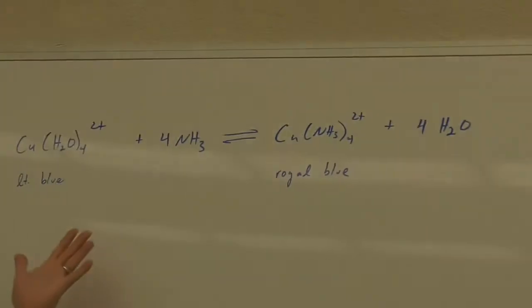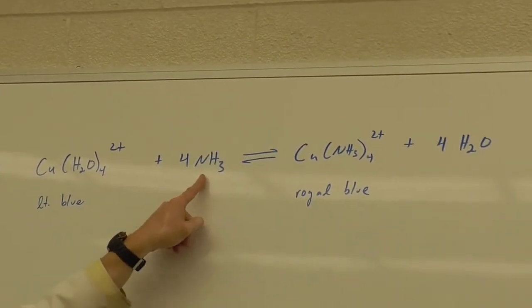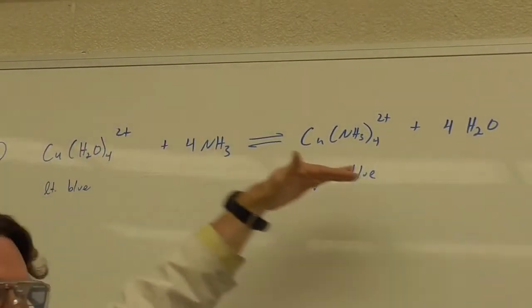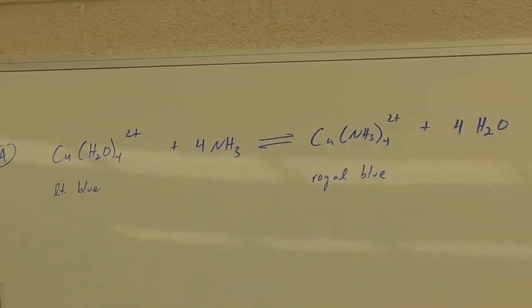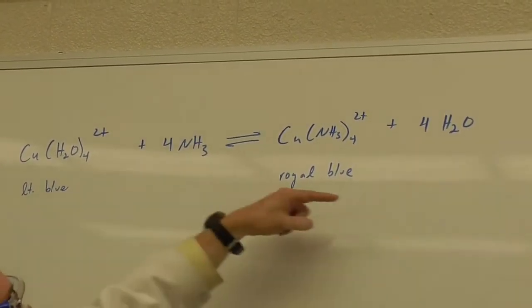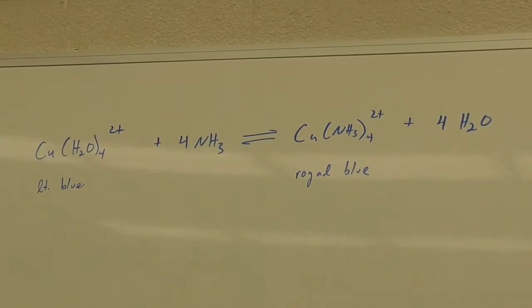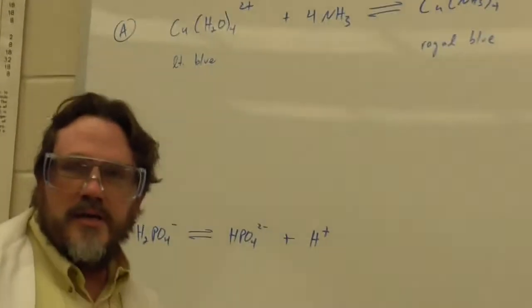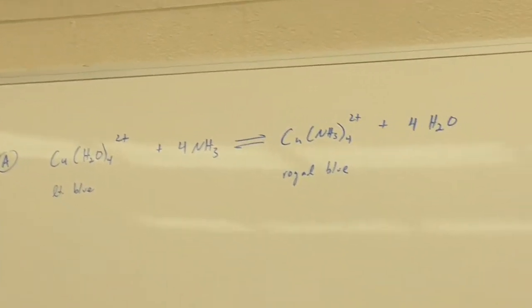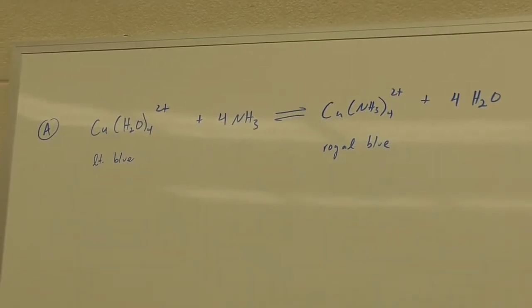If I add something, say, to the reactant side, let's say let's add more ammonia, then it's going to shift to the right to use up that ammonia and regain that balance of the equilibrium. It's always dynamic. Even when it's at the balance point, we're going forward and back, but the rate forward would equal the rate reverse. And so we're going to demonstrate that in several different experiments here, and hopefully you'll get a good feel for LeChatelier, the idea of shifting when you disturb that equilibrium.